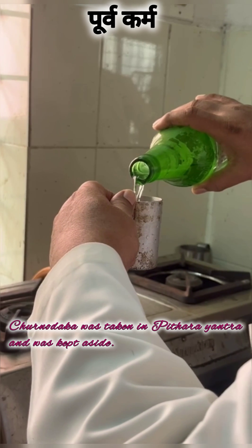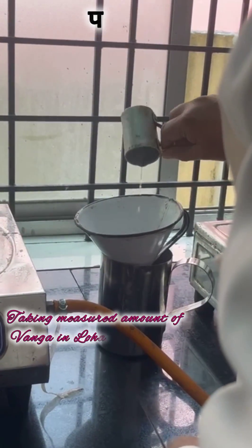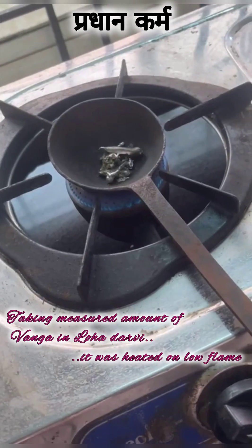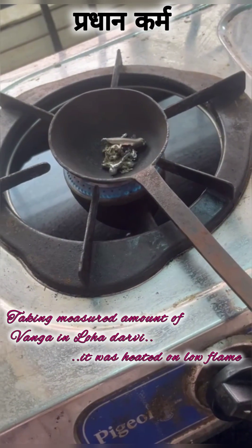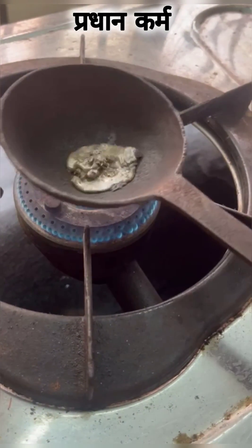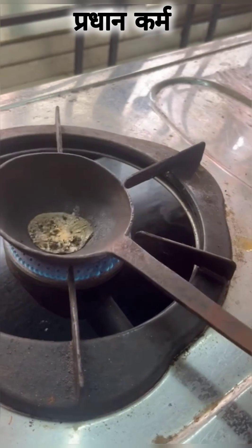Firstly, churnodhaka is taken in a peetara yantra and was kept aside. We then have taken ashuddha vanga in a loha darvi and heated it on a low flame. Ashuddha vanga gradually melts and one can notice grayish black colored scum on it and smoke every time we heat further.